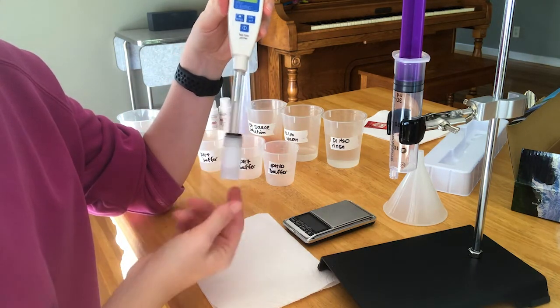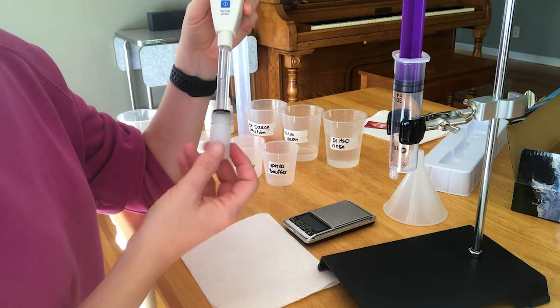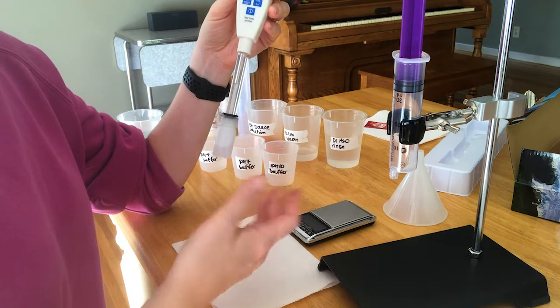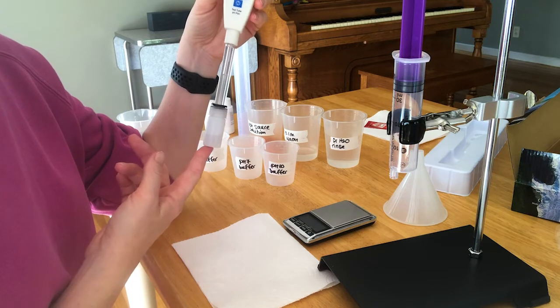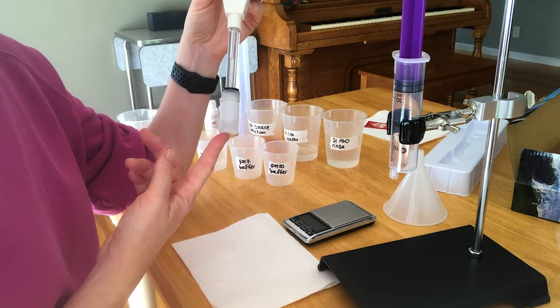This pH meter has a glass bulb which is porous and needs to be stored in this salt solution at all times except for when you're using it. You don't want it to dry out, so whenever you're not using it make sure it's in there. If for some reason it was laying out, it needs to soak in this salt solution for at least 10 minutes before you use it.